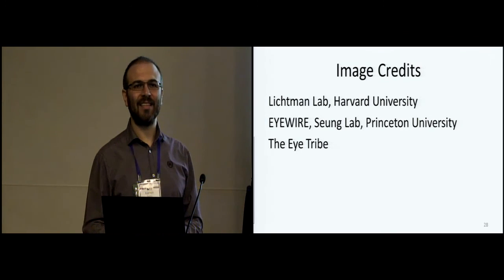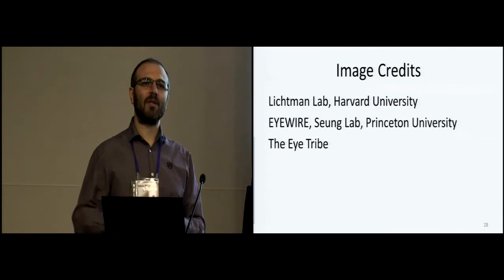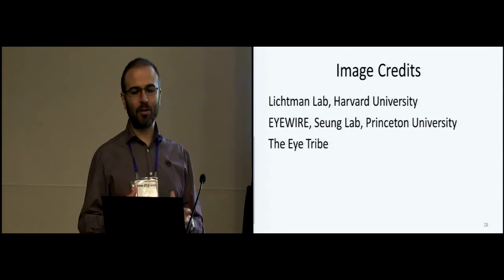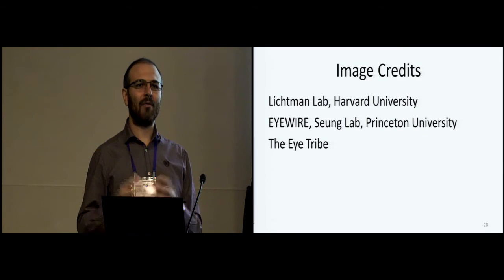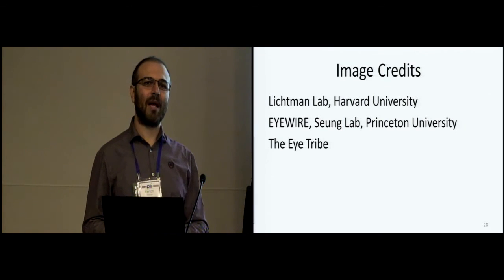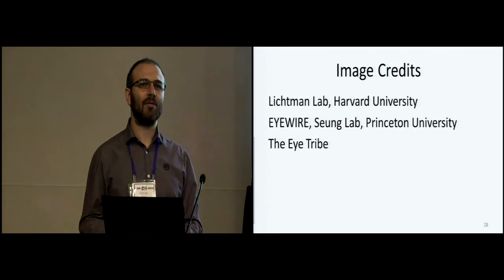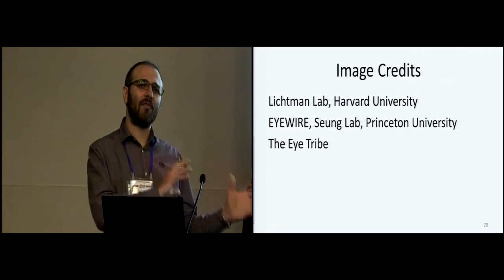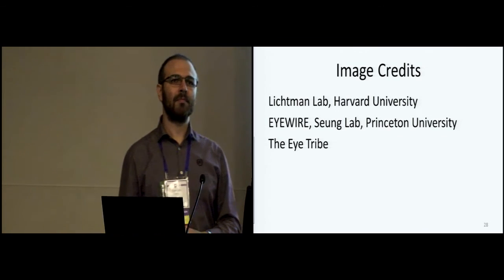Hi, nice talk. Quick question. So your mouse-based segmentation was done by an expert, right? That's right. And the gazing was not done by experts, right? So the gaze tracing was done by participants. Okay, so maybe it would even be better with an expert, right? Of course, but we wanted to test with novice users, and we wanted to see the potential of using this system potentially for gamification aspects. That's why we also used novice users. But partially they were from the neuroscience domain, so they were not totally unfamiliar with what was going on. Okay, cool. Thanks. Thank you.